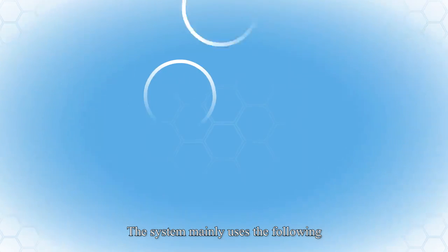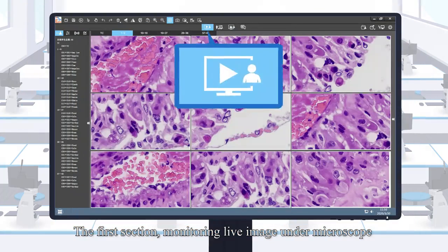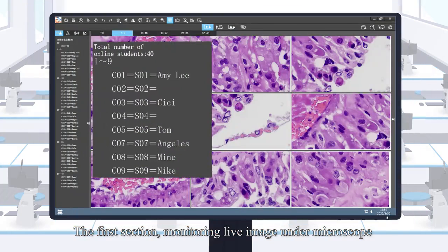The system mainly uses the following six functional sections to improve teaching efficiency. The first section, monitoring live image under microscope.